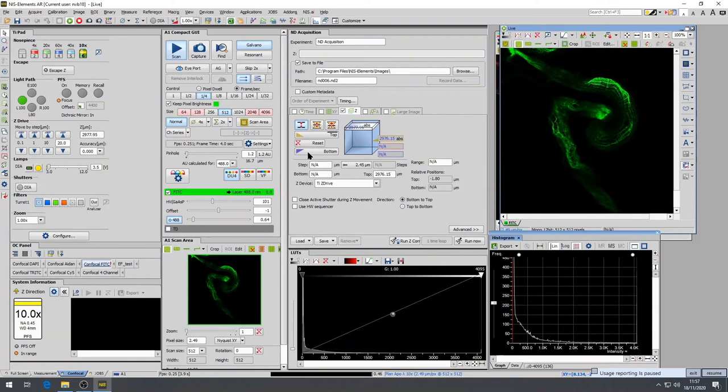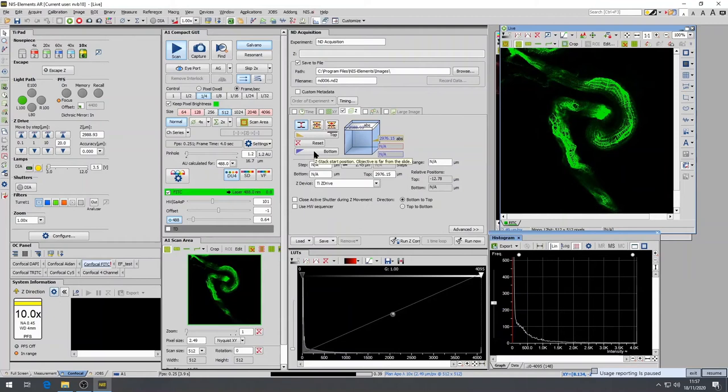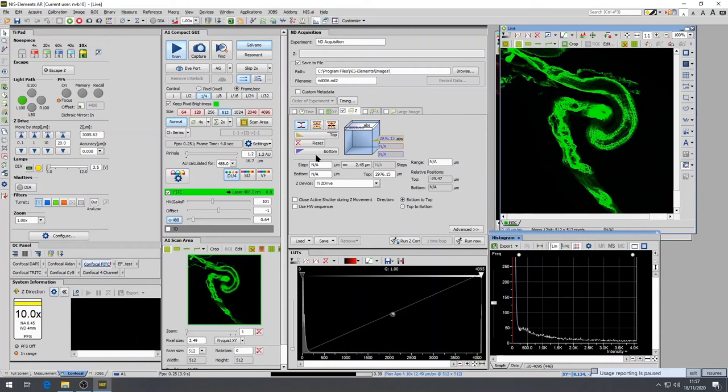After selecting the top, move the Z-Wheel in the opposite direction, passing through your central focal plane until the image again is barely visible. Mark this position by selecting Bottom in the Z-Stack panel, and press Scan to stop the lasers.